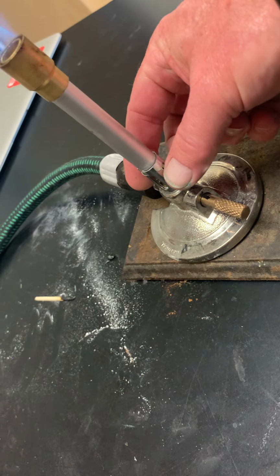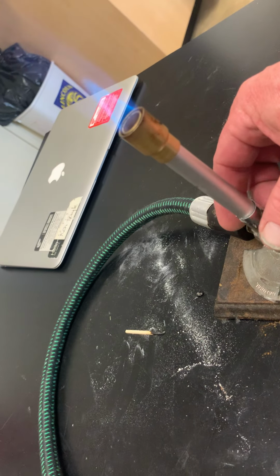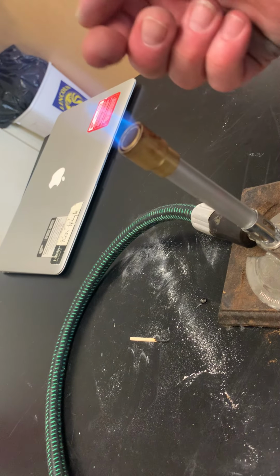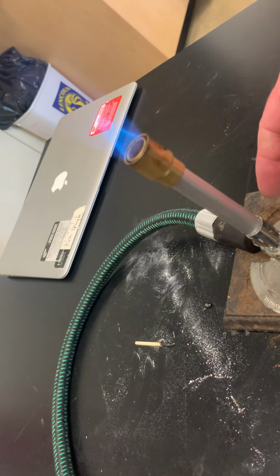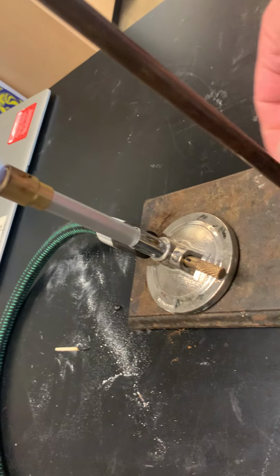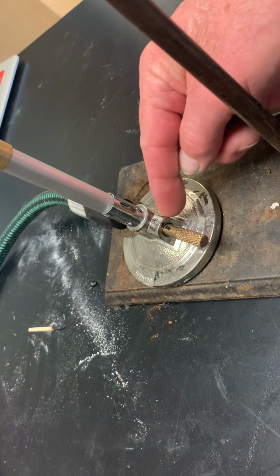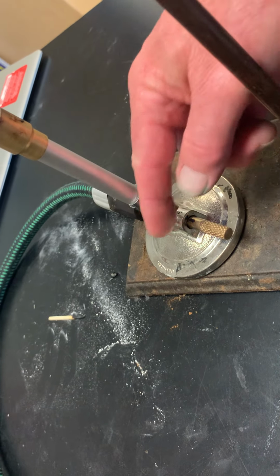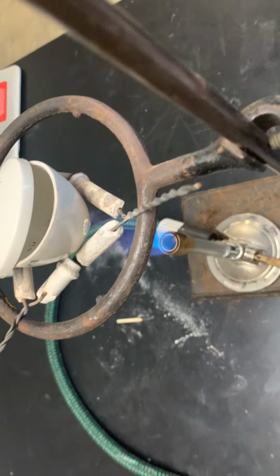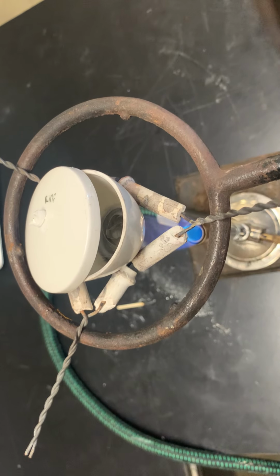My Bunsen burner has these little windows in the bottom. And if you take them away, the flame basically goes down. This is really hot right here where it's really blue. It's the hottest part of the flame. And this is my turning on and off. I have a little thing written here, low, and on the other side, high, so I know which way to turn it. And if we go back up here, like I said, there will not be a reaction.